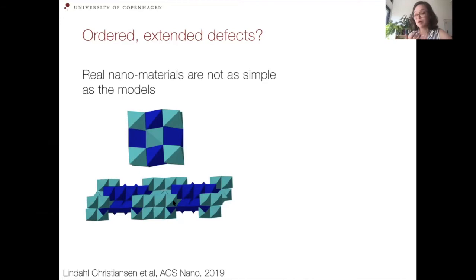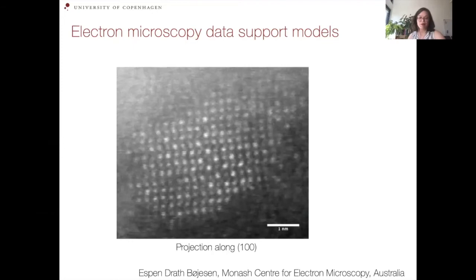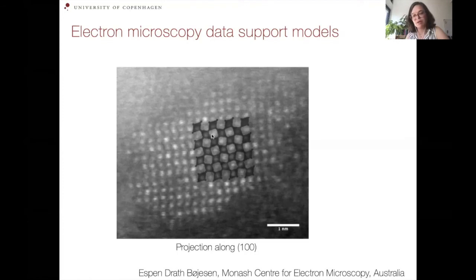We would rather have different areas of the structure where we have this shearing. And we can see that actually with some nice TEM, where we look at one of the small particles that we saw before, of about 4 nanometers. Here we have atomic resolution, so we can try to overlay it with a rutile lattice. So this would be a rutile lattice that we overlay here. And what we see is that we actually do have, as we expect from the PDF modeling, this extra intensity coming from these defects in the rutile lattice, as we saw before with this very simple model.